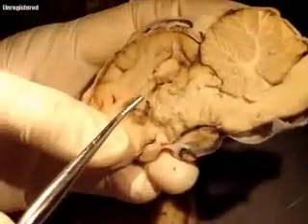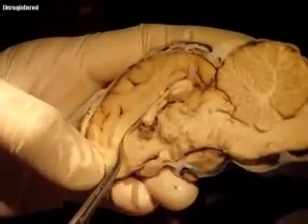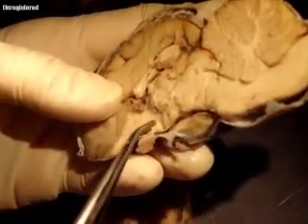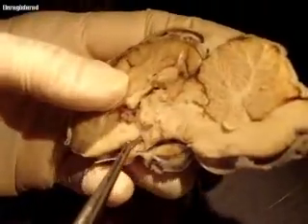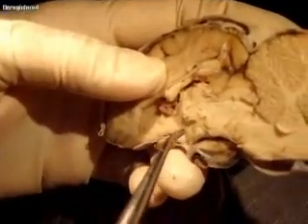Septum pellucidum is a little clear membrane that separates the two lateral ventricles, and this one does not have a good septum pellucidum for me to show you. The mammillary body, let's see, this is the optic chiasma here. So the mammillary body is right down here.